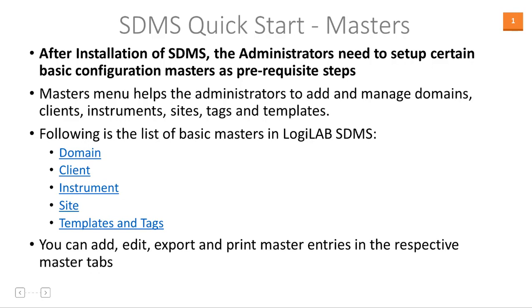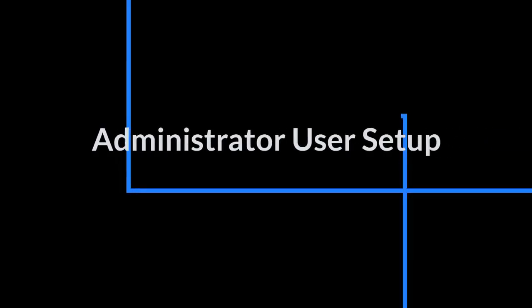The users can also edit the master's data and export to Excel file and then print the master entries in the respective master tabs. Now let us proceed how the administrator user can be set up in the SDMS system.